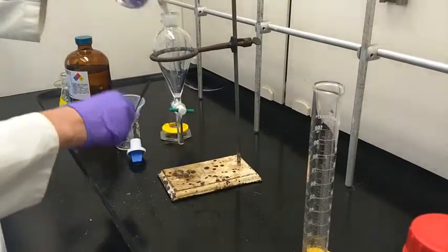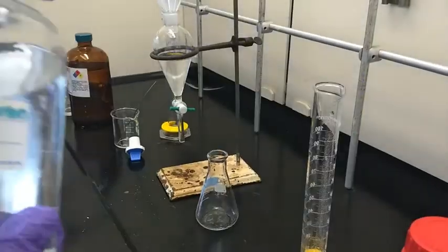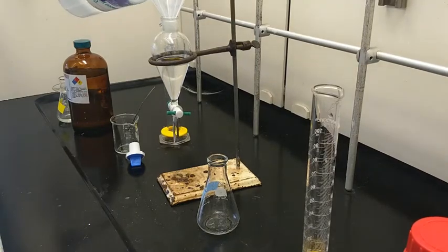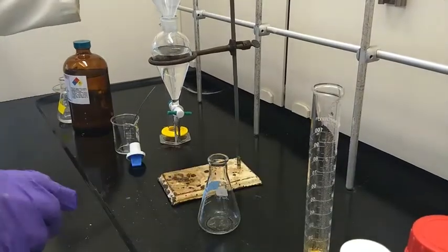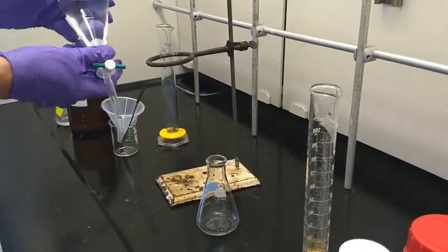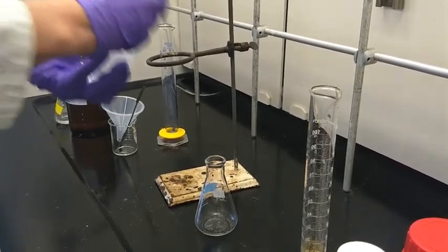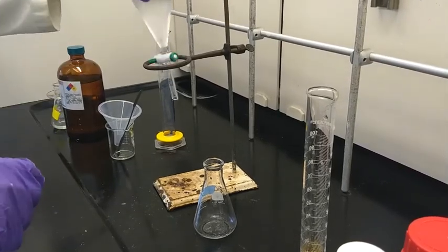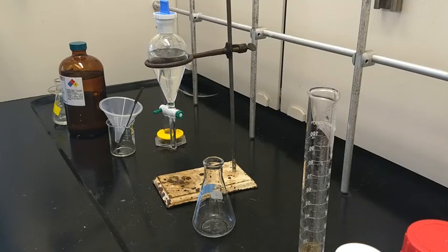One more step I want to show: a brine wash. I put the organic layer back — this is the last step — and we add saturated sodium chloride to help dehydrate it. You'll see the solid in the bottom of that bottle; you don't want to grab the solid. We simply add the solution to the flask to dry the wet organic layer, do the exact same agitation steps, let it reach equilibrium, and then collect the organic layer.